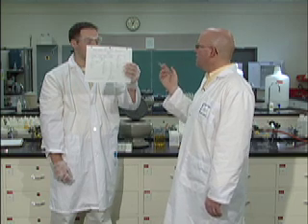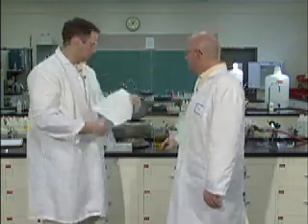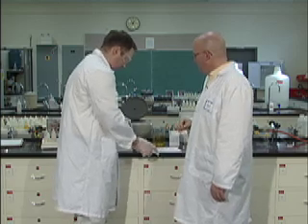And actually, because we don't use mercury anymore, you can just cross off the mercury on this flow chart. So I'm sure the precipitate was silver chloride. Yeah, but we're just going to double check just in case. Good idea. So we're going to double check to make sure we have silver.